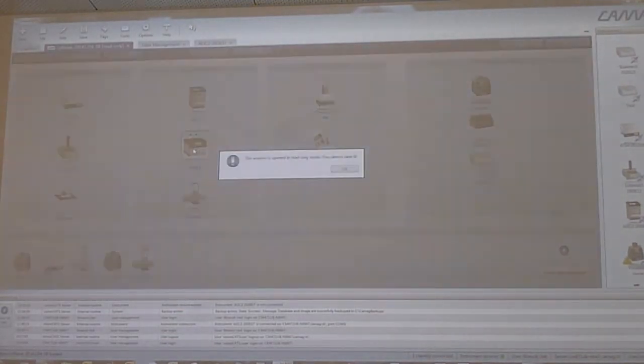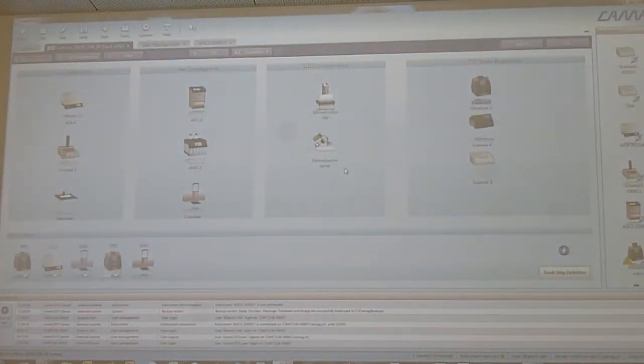So if I add an instrument, this is immediately saved. Therefore, adding an instrument doesn't work. So therefore, I can't change this analysis or method or comparison. And therefore, this is one of the 21 CFR 11 tasks. You have to have it read only.